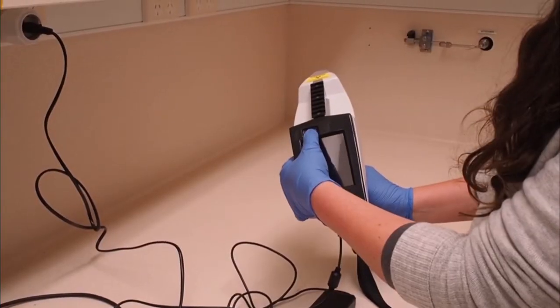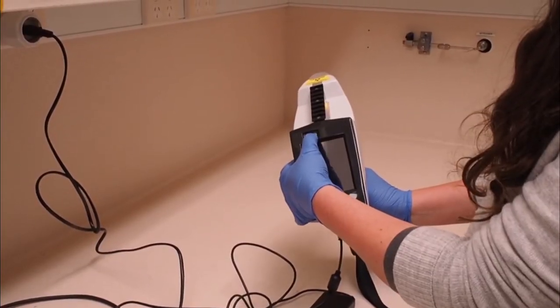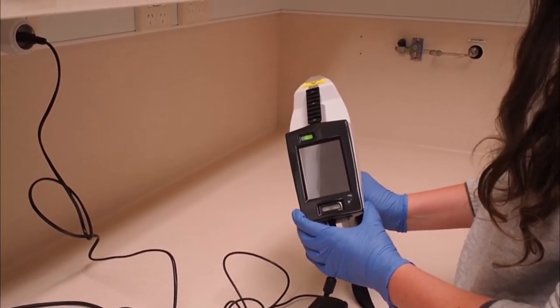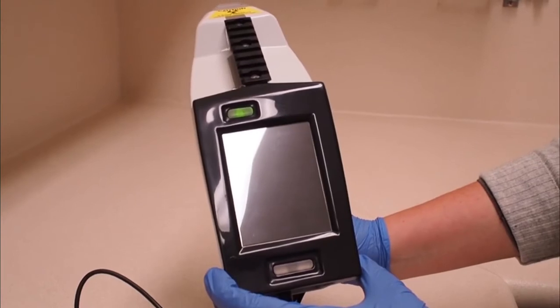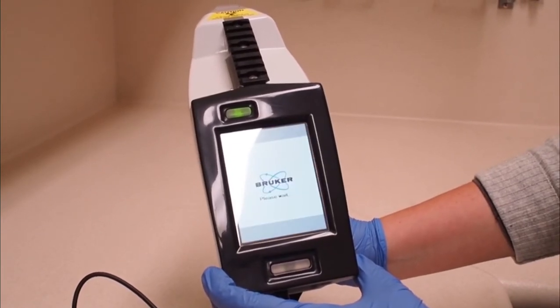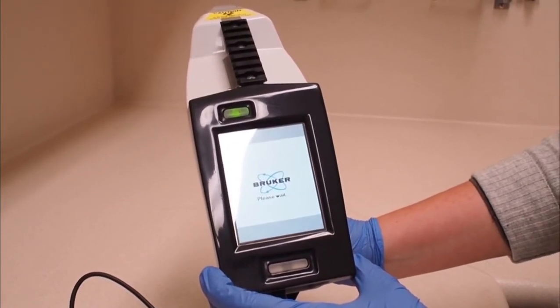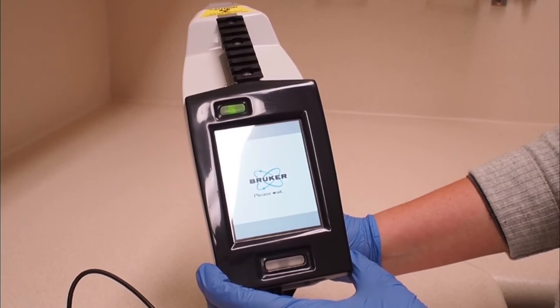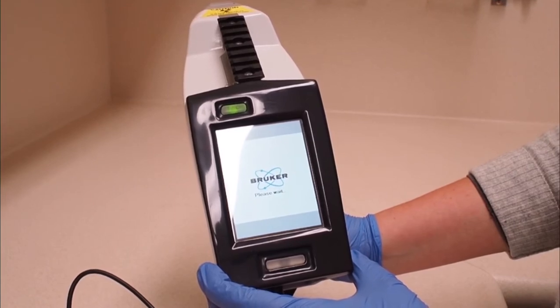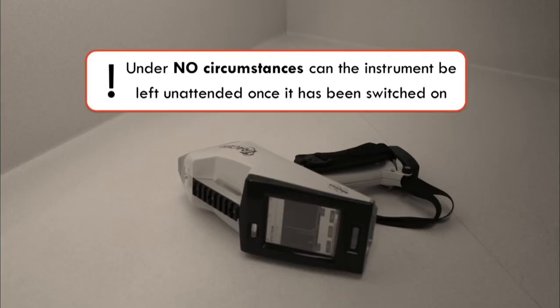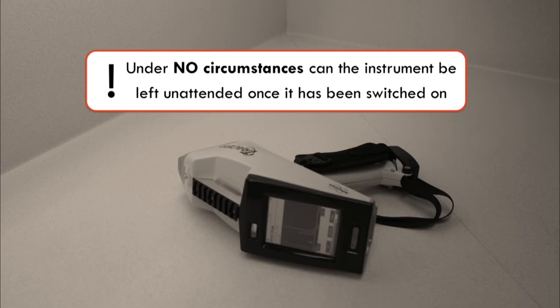Once the tracer is in position, turn it on using the power button found on the top left corner of the screen. Give the x-ray tube approximately 10 minutes to warm up and be ready for use. Under no circumstances, except in the case of an emergency, can you leave the instrument unattended once it has been switched on.